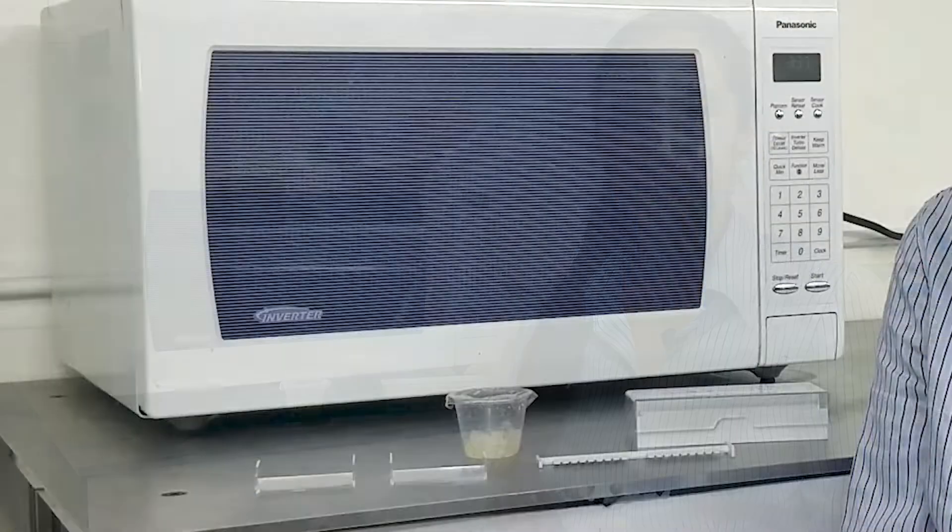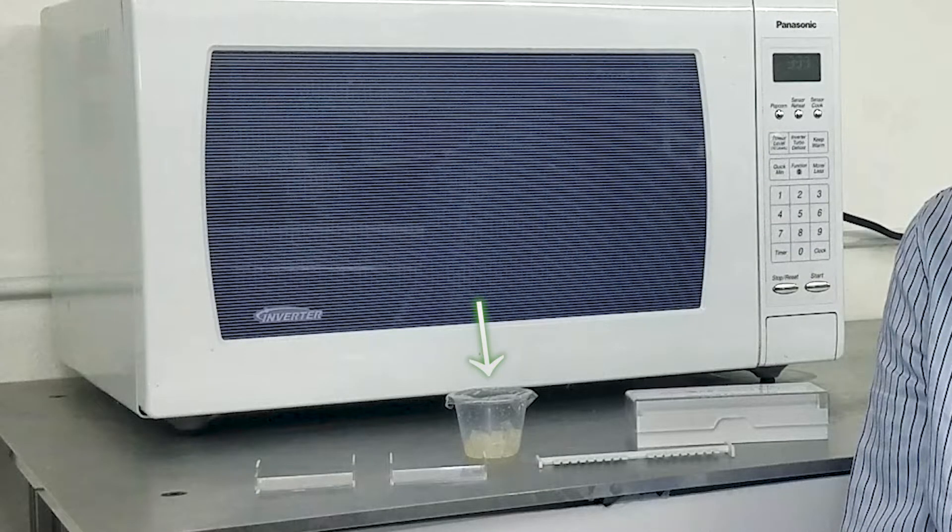We'll be demonstrating how to make agarose gels using the Mini 1 electrophoresis system. You will need a gel green cup, a microwave, casting stand complete with gel casting trays and combs, and a paper towel.